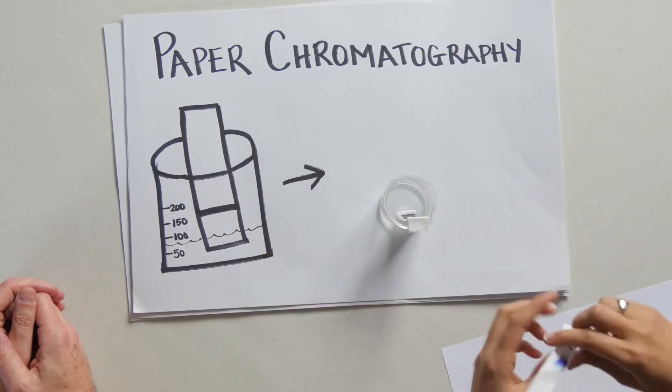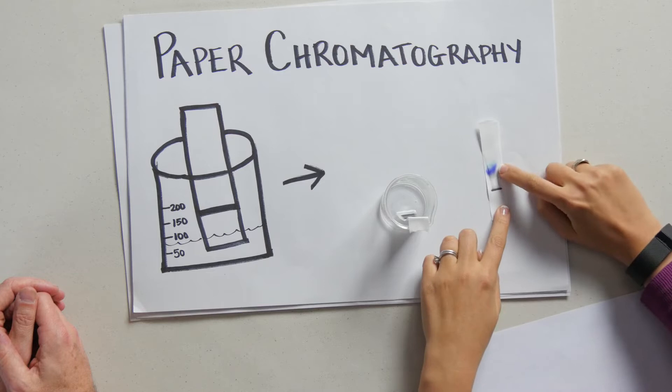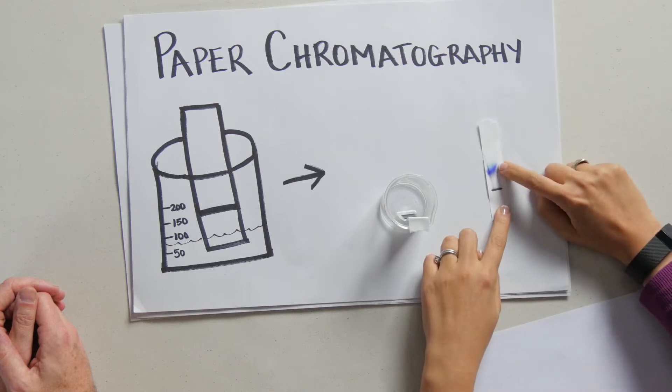And then after a little while, take some time, you end up with something like this. So you can see here we have our black line, our ink that started off, that separated into two bands - the purple and the blue.